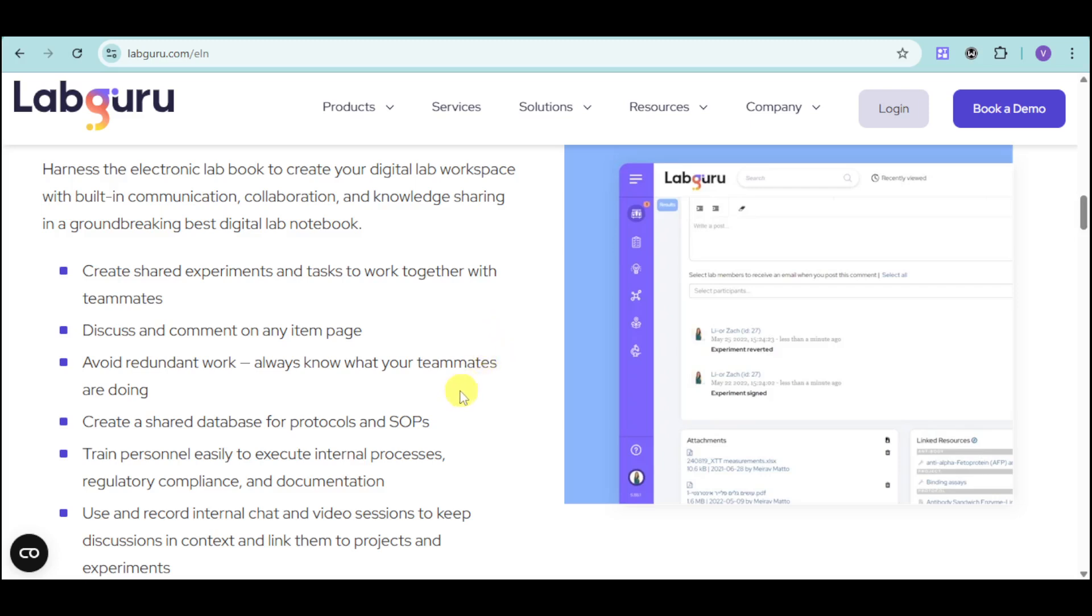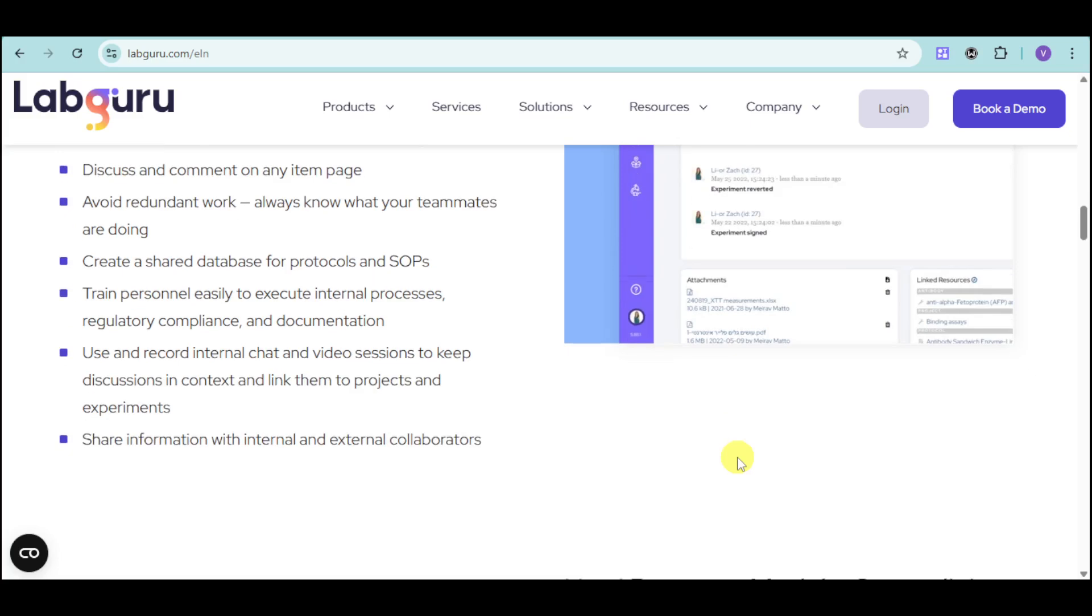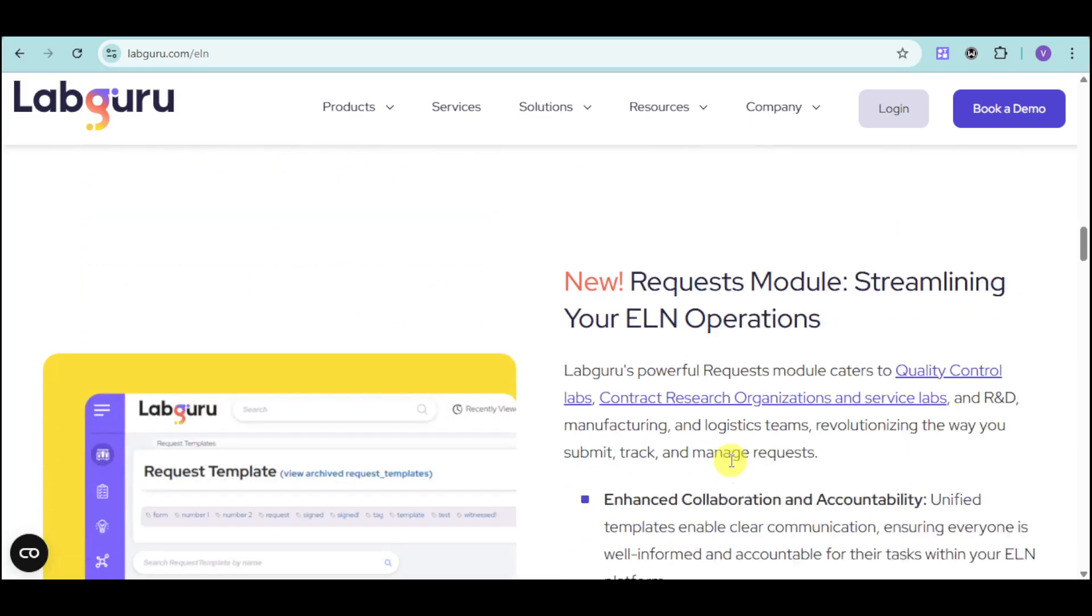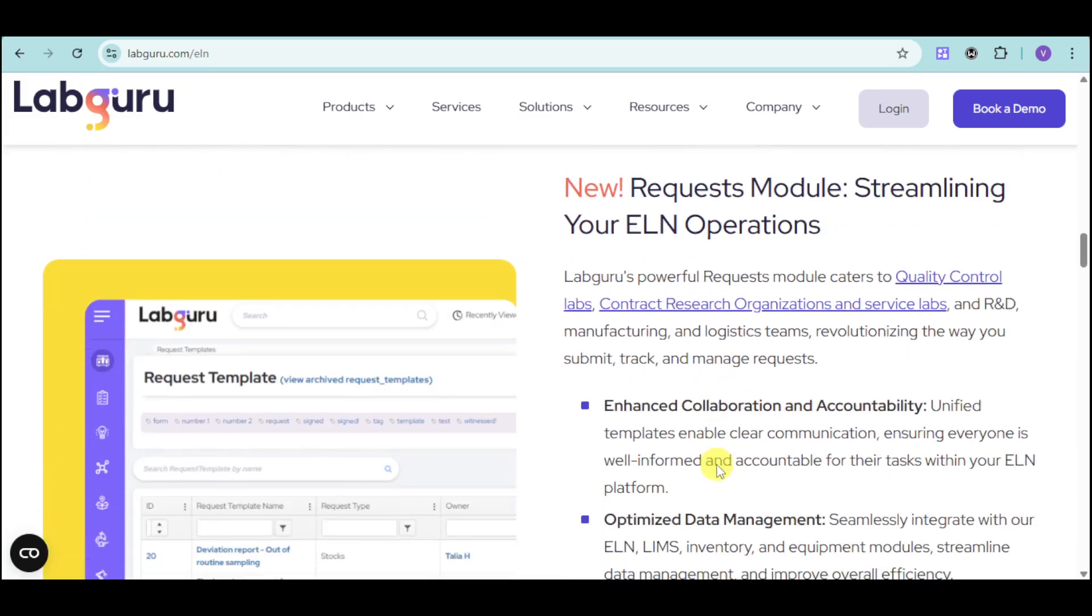You will avoid redundant work because you will always know what your teammate's doing. You can create shared databases for protocols and SOPs, train personnel easily, and use and record internal chat and video sessions as well.